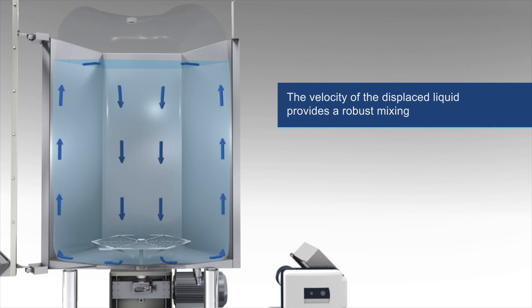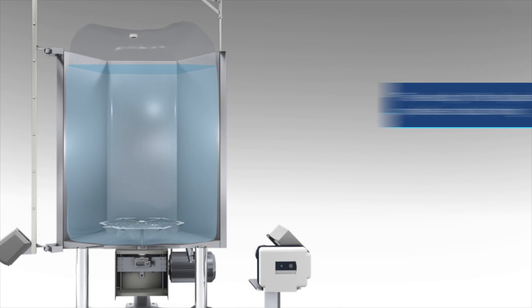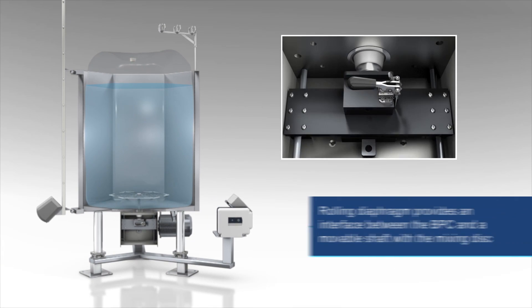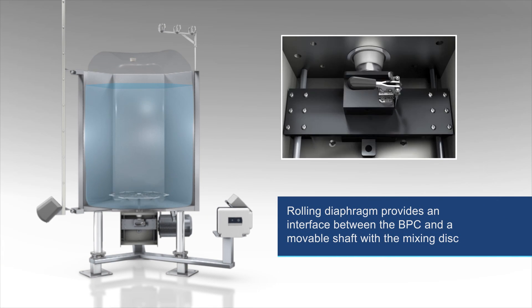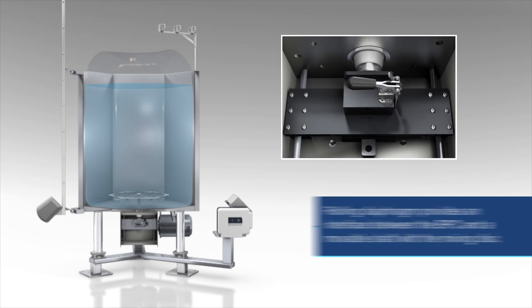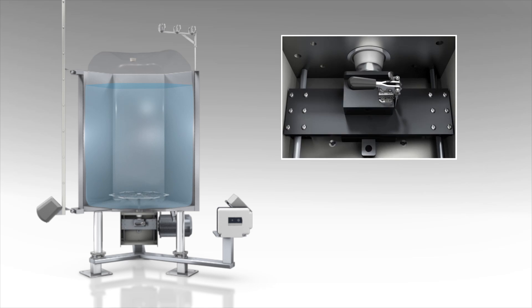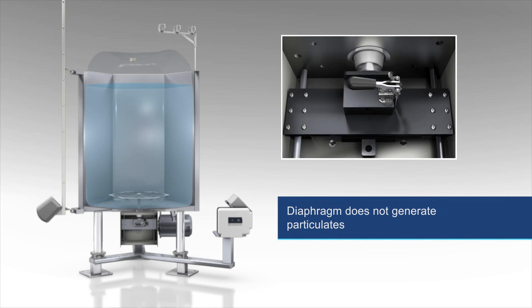The velocity of the displaced liquid provides robust mixing. A rolling diaphragm provides an interface between the stationary part of the BPC and a movable shaft with the mixing disk. There are no contact surfaces between the sidewalls of the rolling diaphragm when in motion.